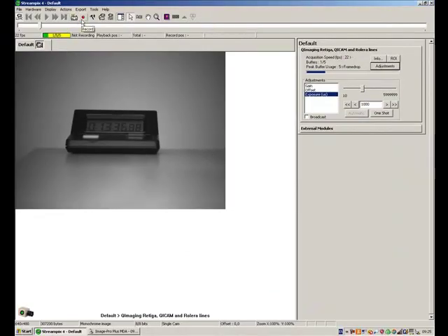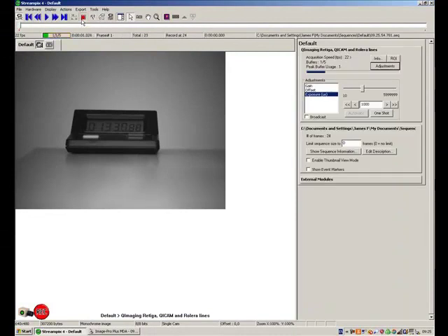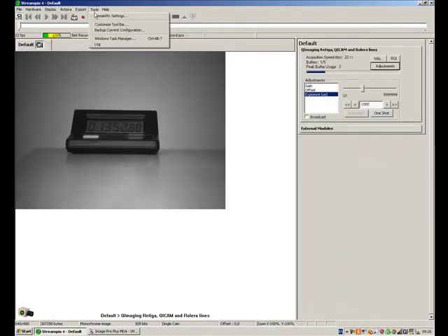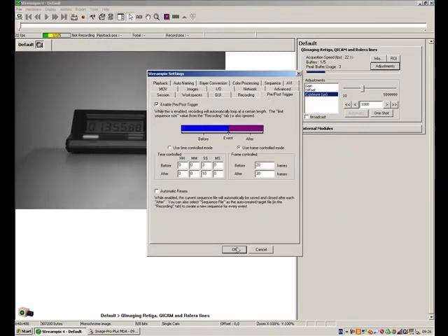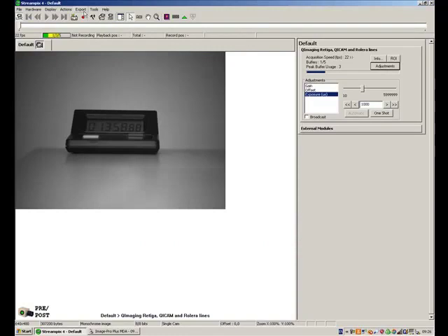So I'm going to be free running. So I'd be doing my experiment now. I'd say, okay, something's going to happen now. Maybe we're monitoring an intensity, or we're doing patch clamping, or we're looking at voltages. And I say, that's interesting. In fact, that's not. I haven't set it up. Let me just make sure that I've actually got pre and post triggering enabled. That'd be good, wouldn't it? So now I'm doing it.